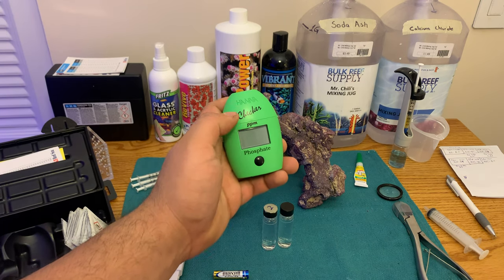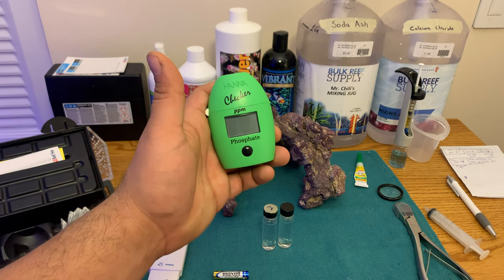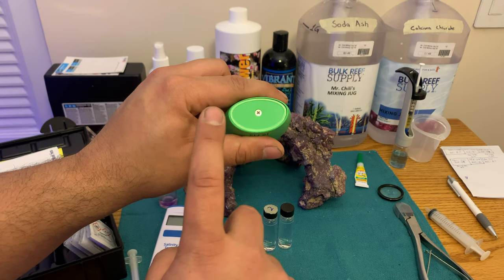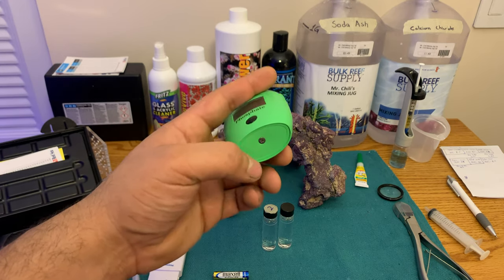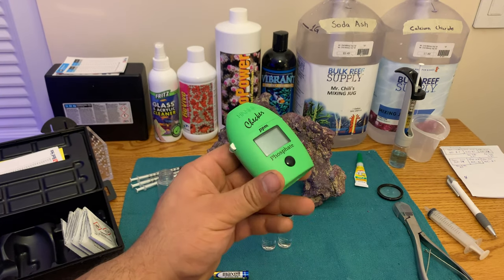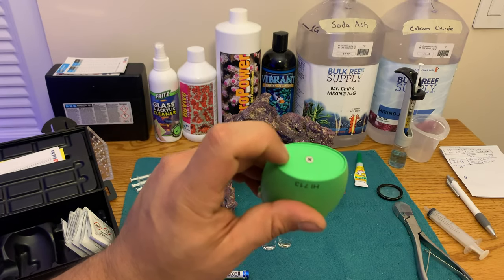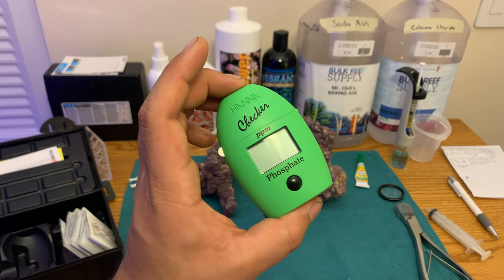I thought this was a good tip to share: when your Hanna checker's battery starts to go bad, it can produce incorrect values. So what I'm gonna do from here on out is put a piece of tape on here with the date I put the battery in, so when I look at the bottom of the checker I'll know how long that battery has been in there and when I should go ahead and change it.